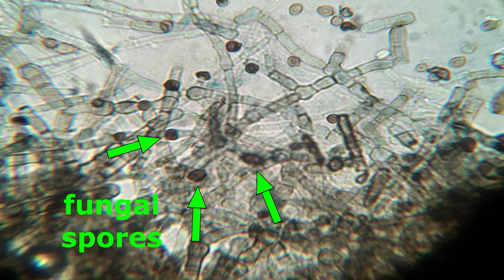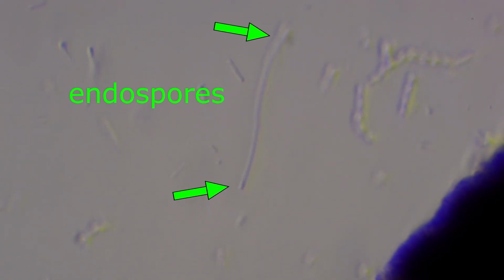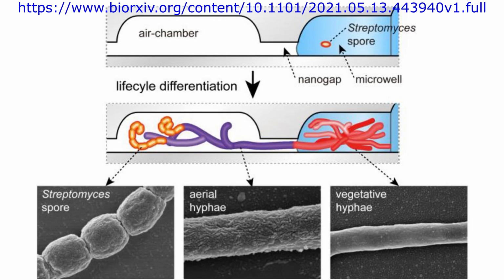Well, Streptomyces can form spores, but unlike fungal spores, these are bacterial spores, which are often referred to as endospores, which, unlike fungi, form specifically inside the cell. However, I later learned that Streptomyces are somewhat an exception to this rule, but we'll get to that later.